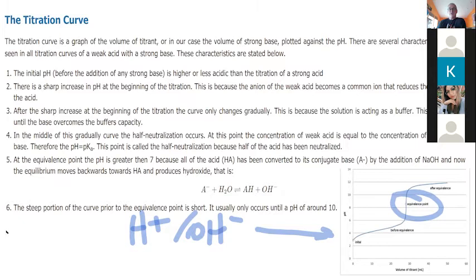You're right, something will change color, but it's not going to be the hydroxide and it's not going to be the acetic acid. What's going to change color? Is it because of the pheno thingy? I can't pronounce it. The phenolphthalein. Yeah, so what do we more generally refer to that as? Catalyst? Not really a catalyst because it doesn't catalyze a reaction.